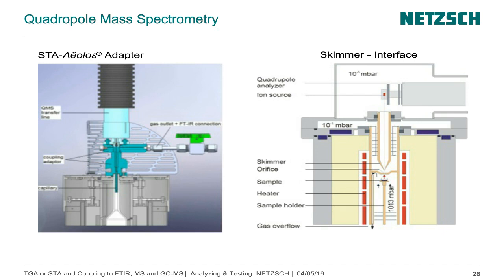And the mass spectrometer only needs a small amount of your gas, so we have an outlet on the side where you can attach another gas analyzer if you want, or only go to the waste. This is a normal coupling which everybody has, and the easiest way to couple a mass spectrometer to any other instrument which you want.